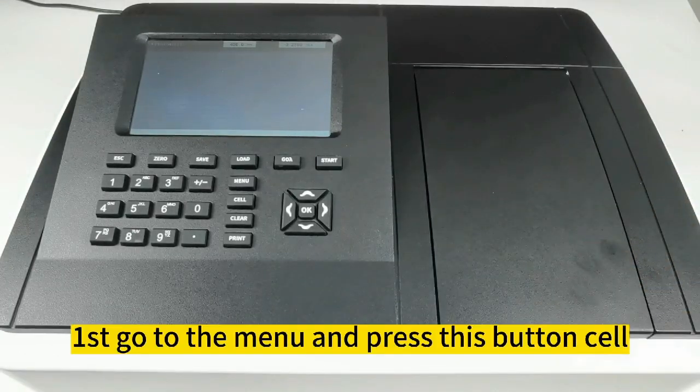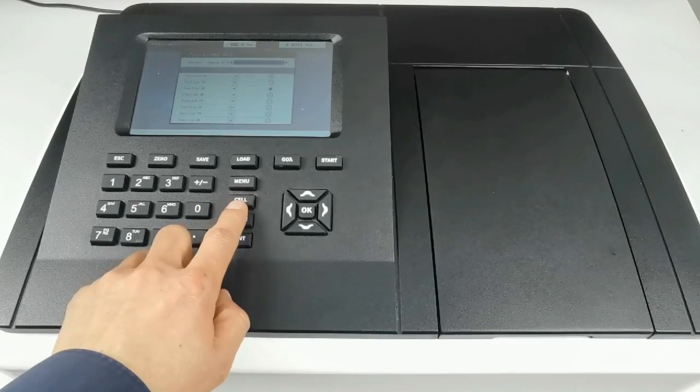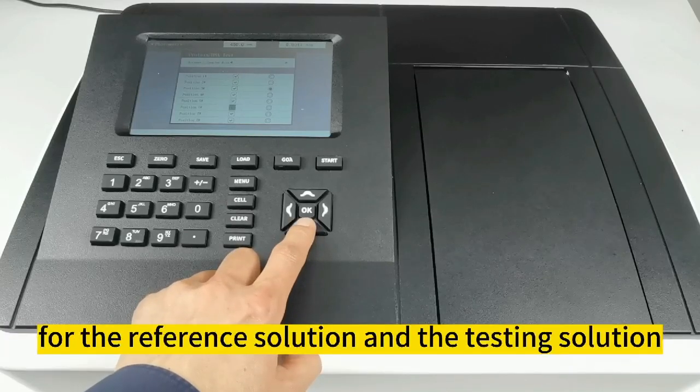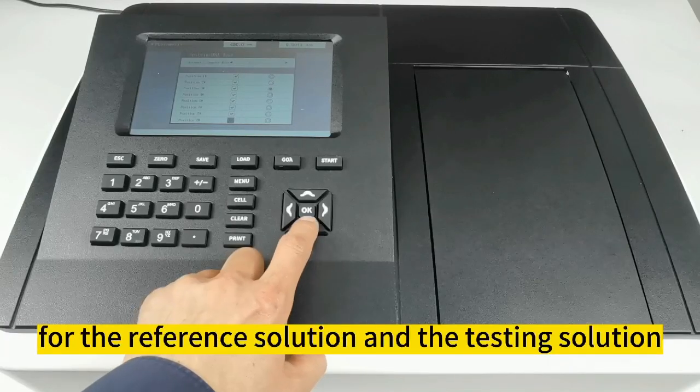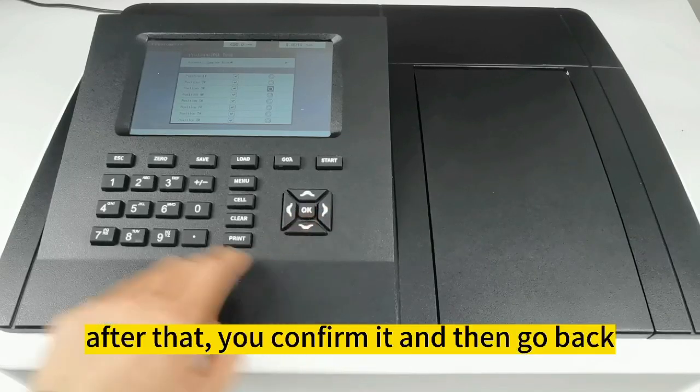First, go to the menu and press this button — cell — then press the down button to choose different positions for the reference solution and the testing solution. After that, confirm it and go back.